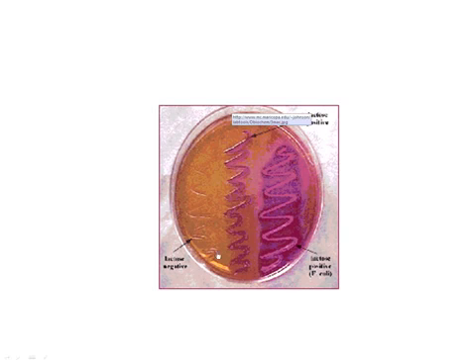An analogous picture to the one we saw of the EMB here. In this streak, bacteria is growing, but no color, so this is a gram-negative. In this streak, bacteria is growing, and it's pink, so this is a gram-negative that ferments lactose. Just as we saw in the EMB, when we have E. coli growing on the MAC, it also gives us an interesting color. Not metallic green, but what we consider a cotton candy pink color will form.